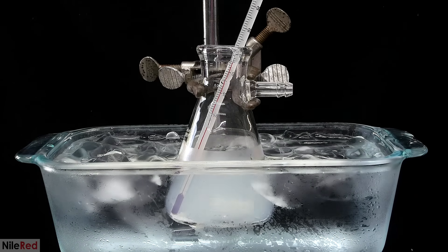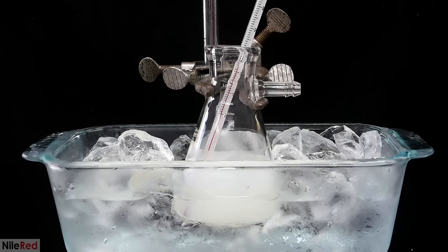As more potassium hydroxide is added, the solution slowly gets more and more opaque, until it's eventually completely white.